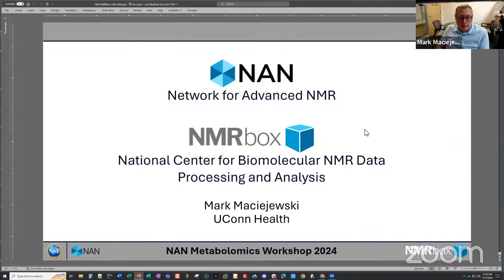So, yeah, as Art pointed out, I'm going to give a presentation. I'm going to flip back and forth between some PowerPoint slides and a web browser, maybe NMRbox. So I'm going to share my screen so I can bounce back and forth between some windows. I'll talk about NAN at first, and then I'm going to talk about NMRbox.